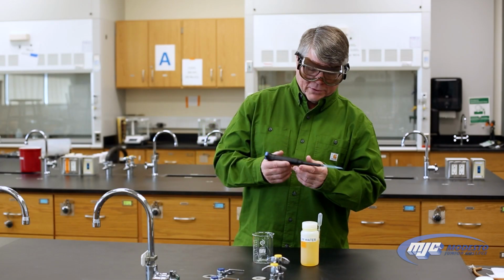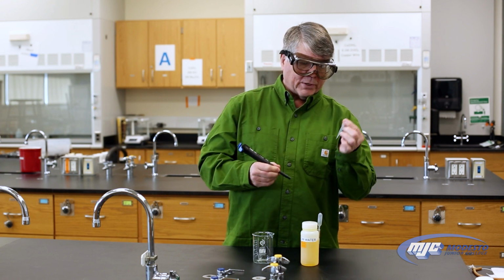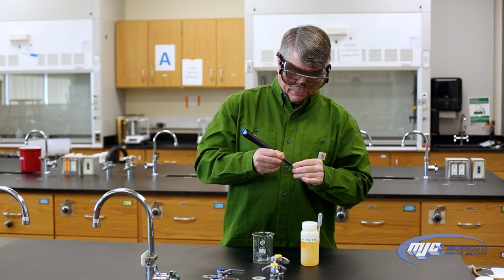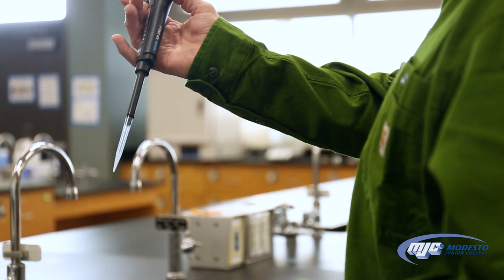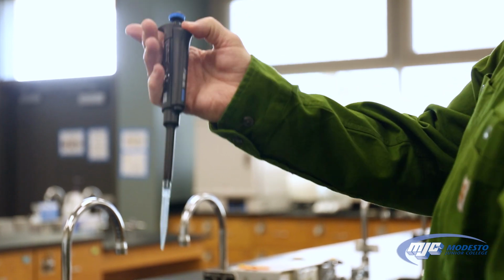Guys, this is an explanation of how to use a micropipette. So you'll need a disposable tip for the micropipette. Grab one of these, make sure it's clean, and pop it on here. And when you're finished, to pop it off, a lot of times it'll be contaminated and you maybe don't want to touch it. So you have this little handle here. If you push down on this right here, it just pops the tip off.